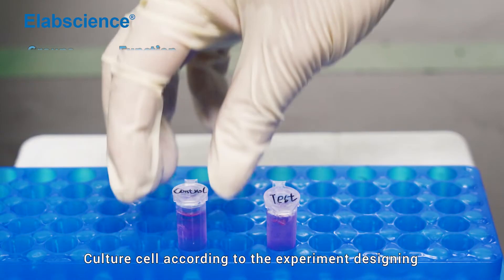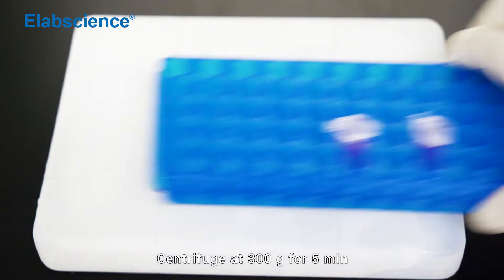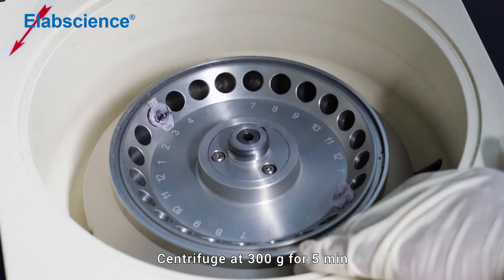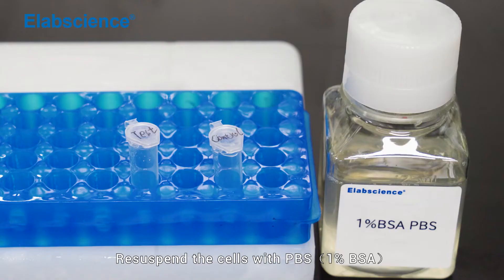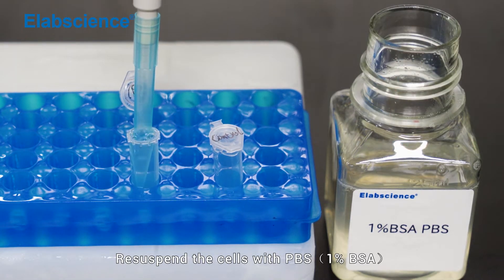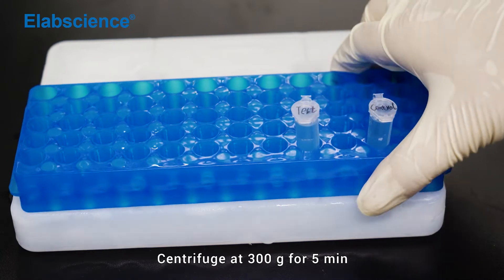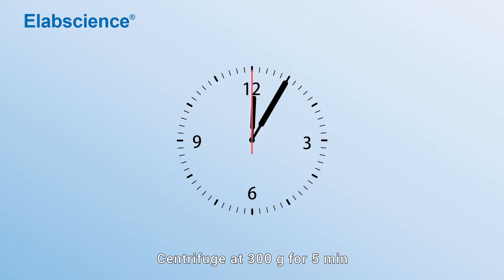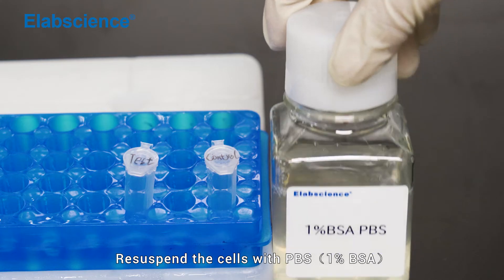Sample Preparation: Culture your cells according to the experiment design. Centrifuge at 300×g for 5 minutes. Discard the supernatant. Resuspend the cells with PBS. Centrifuge at 300×g for 5 minutes again. Discard the supernatant, then resuspend the cells with PBS.